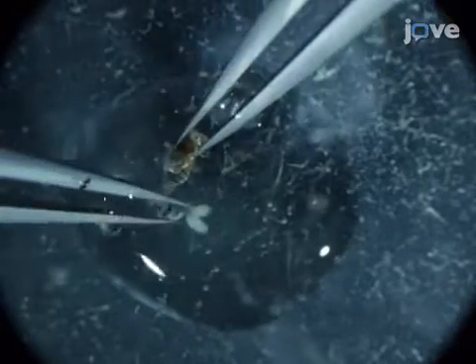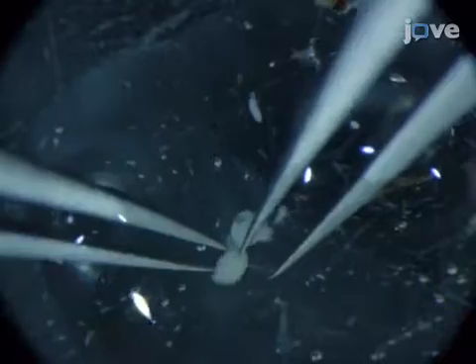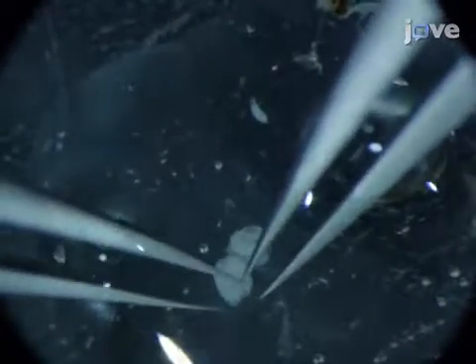Using sharp, fine-nosed forceps, grab a fattened female fly at the lower thorax. Keeping all tissue immersed in medium, with a second pair of forceps, tug gently at the extreme posterior of the fly until the tissues in the abdomen are exposed. Next, detach the two ovaries from the surrounding gut and extraneous tissue. Open the ovaries by pulling gently and expose the ovarioles. To aid penetration of the reagents, pass the tips of the forceps between each ovariole a couple of times.